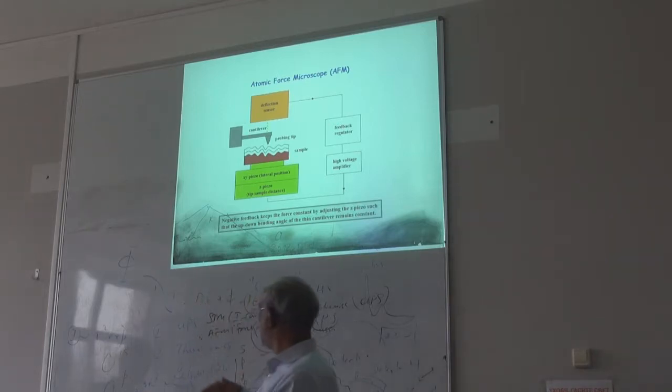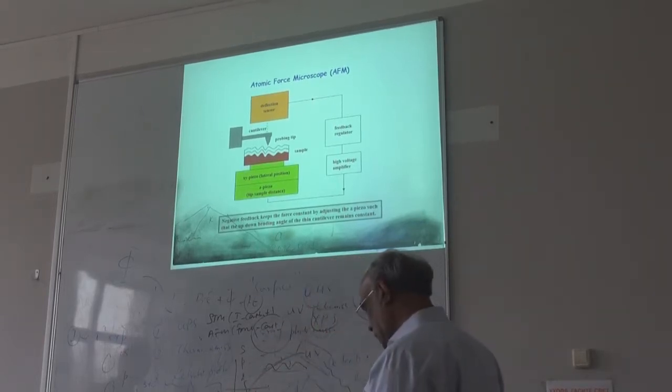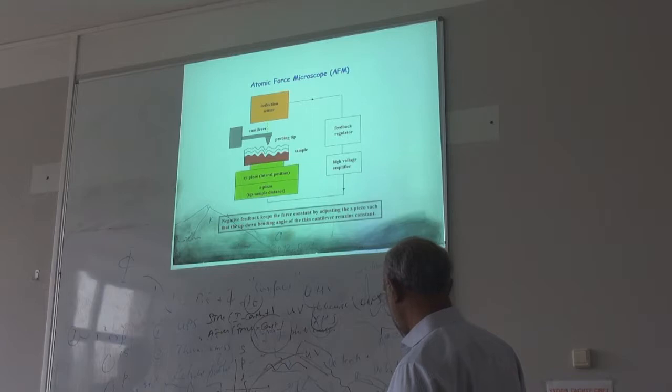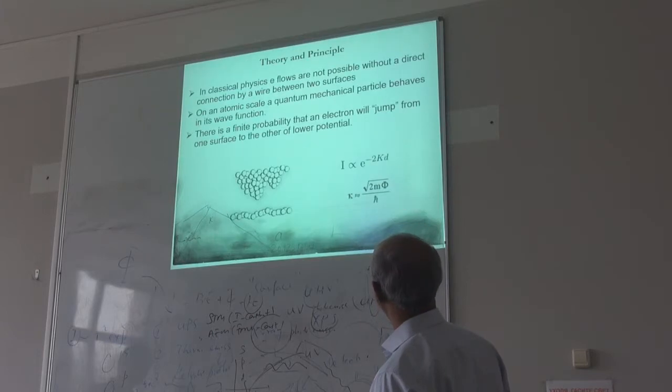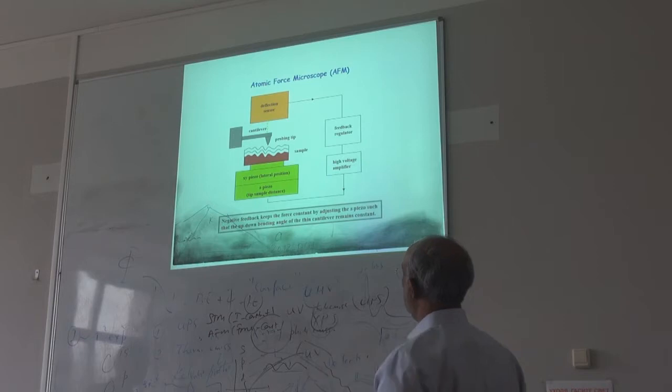To keep the force constant, the tip has to move up and down. So using that same piezoelectric device, you can do the mapping. This is the important thing, this feedback regulator. In both cases, you have a feedback controller, and the feedback controller regulates that.